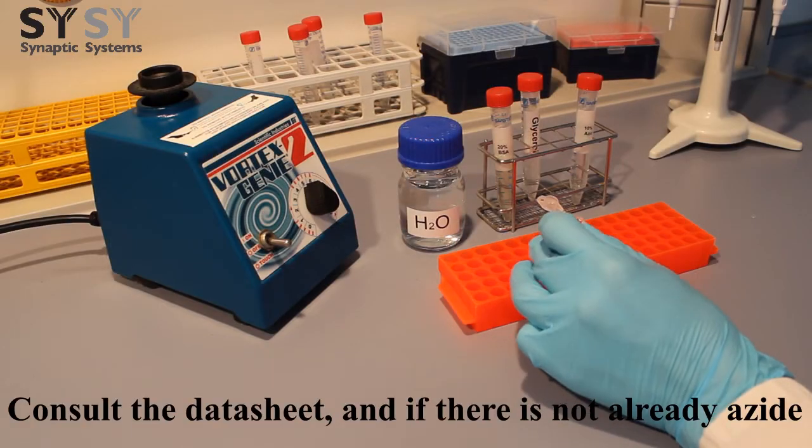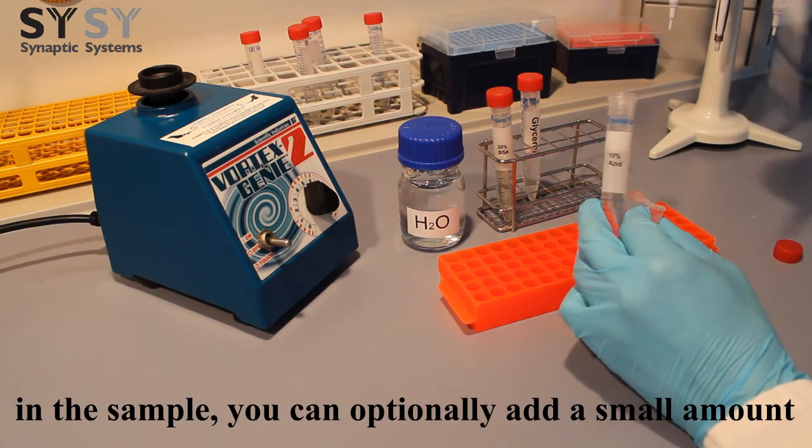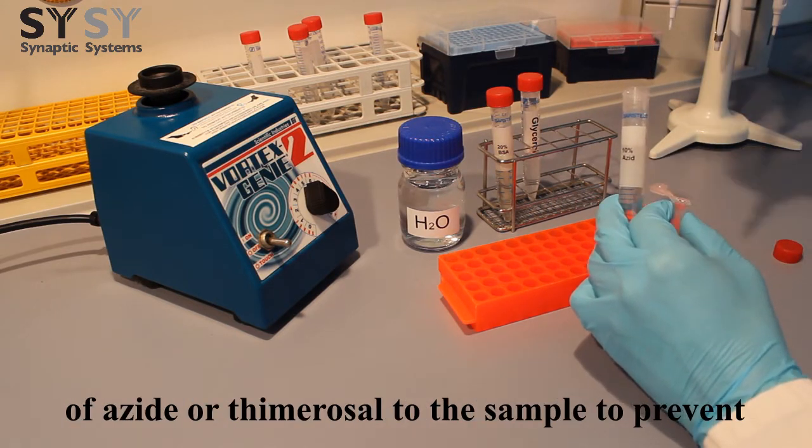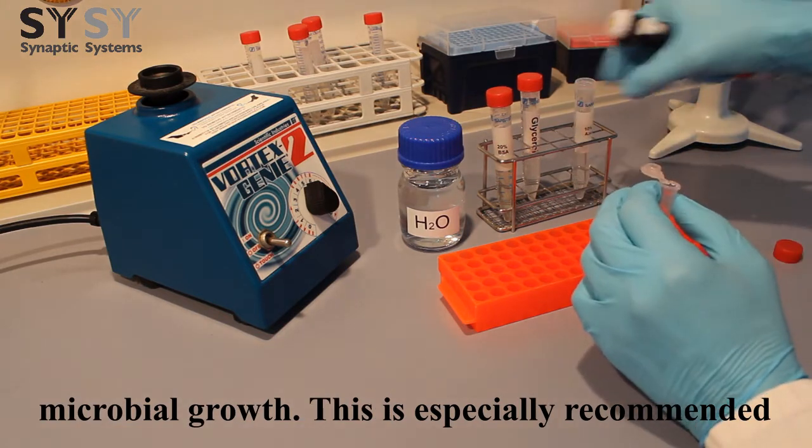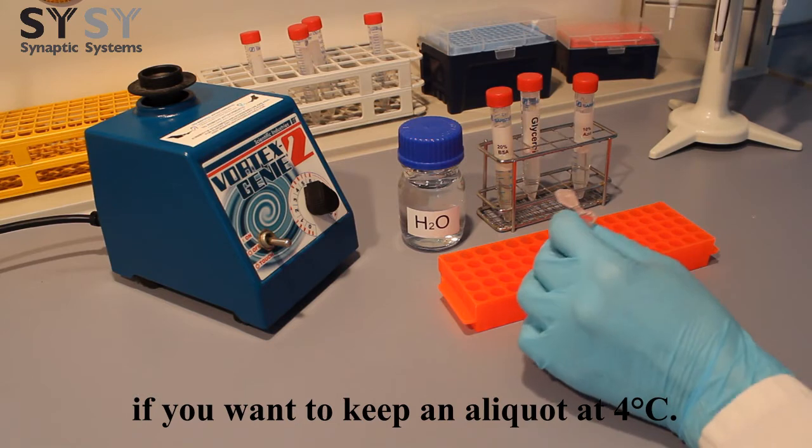Consult the datasheet, and if there is not already an azide in the sample, you can optionally add a small amount of azide or thimerosal to the sample to prevent microbial growth. This is especially recommended if you want to keep an aliquot at 4 degrees Celsius.